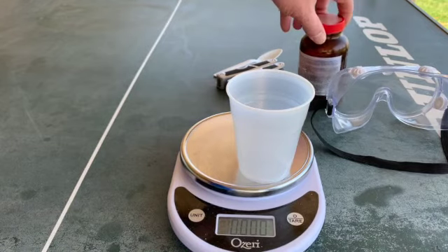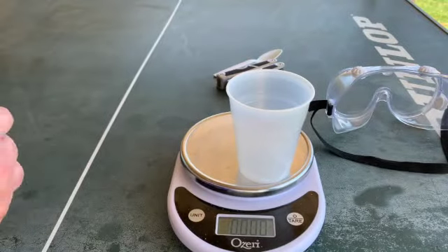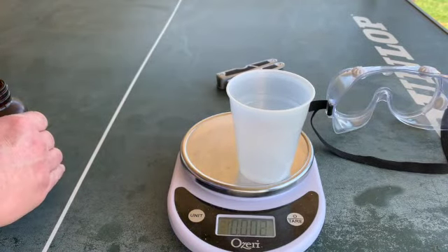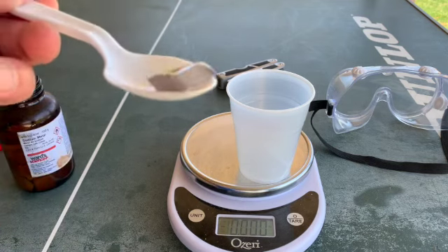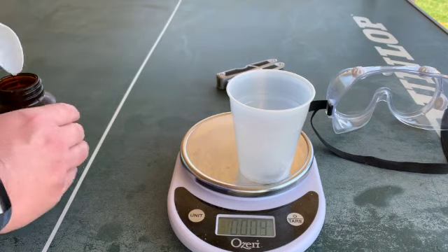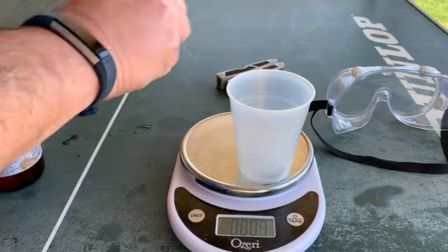Okay, so we're going to weigh out some sodium metal in this example. This is sodium. Sodium is an alkali metal, as most of you remember, hopefully from first semester. I zeroed out the balance. We got a little wind during this demo. So I'm going to put some sodium in there. We're going to add a little bit. I lost a piece there.